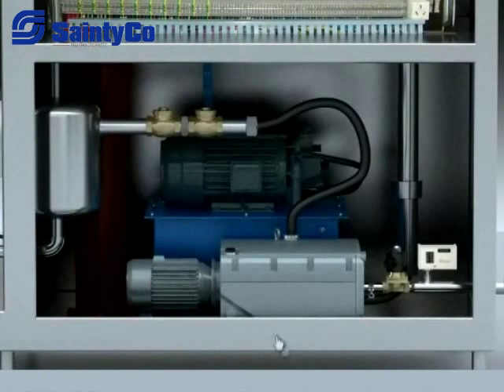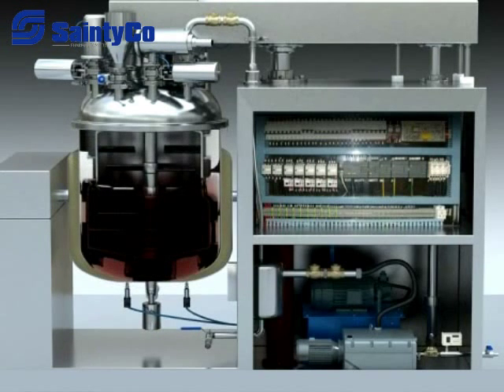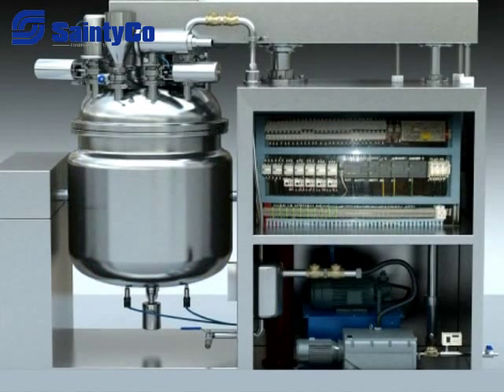2. Vacuum system. It is made up of a vacuum pump, vacuum buffer tank, check valve, vacuum meter, water pressure relay, vacuum thermostatic valve, and water electromagnetic valve. At the beginning of the process, the pressure at the water inlet and air inlet is around 1 atm. When the vacuum pump starts, it draws air in the tank through a thermostatic valve, check valve, and vacuum buffer tank. The emulsifier will not cause any foam under vacuum. The vacuum meter displays the vacuum degree of the tank, and the vacuum protective sensor keeps the liquid pressure in a normal state.